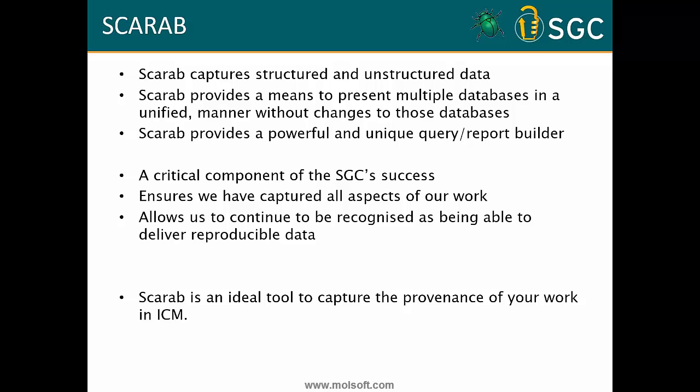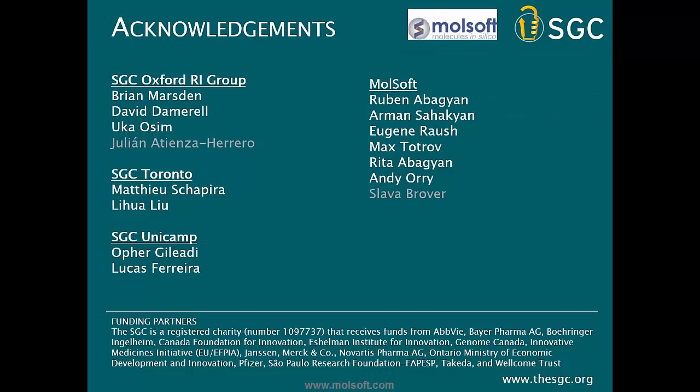We can hook ChEMBL directly into our SGC schema via Scarab. Scarab does all the magic in terms of working out how to join across databases, even when the databases don't know that each other exists, and that's done without any modification of the underlying database itself. I think that's a fairly unique concept. Great. And so overall, and the acknowledgements at the end, but yeah, open to questions.